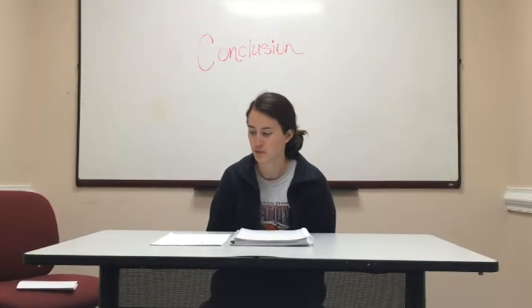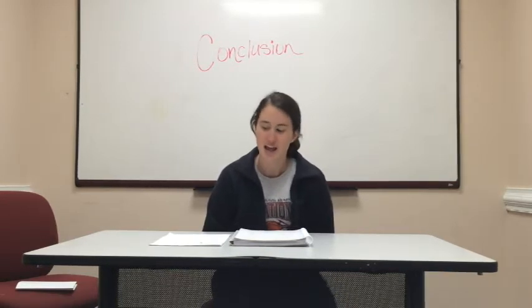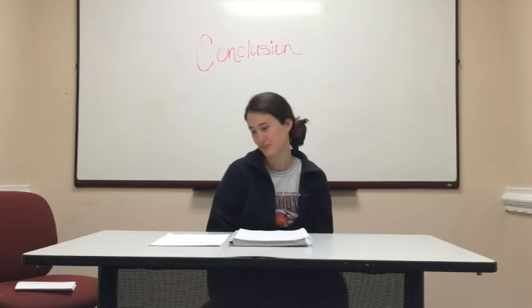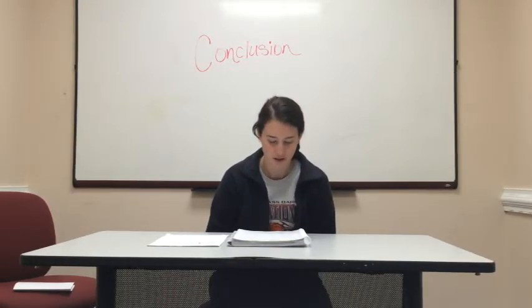In this experiment, we had to make sure we were very careful because we had to heat up the sample in the crucible. So we were dealing with open flames with the Bunsen burner and then hydrochloric acid. We did this so we could calculate the mass and the moles.